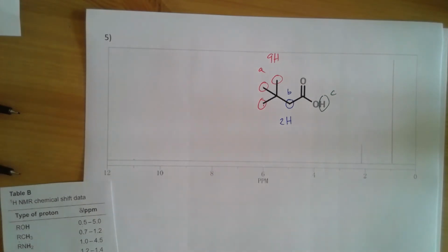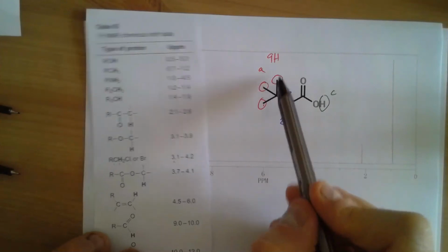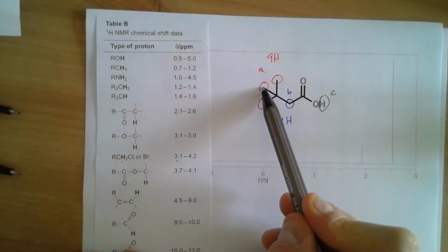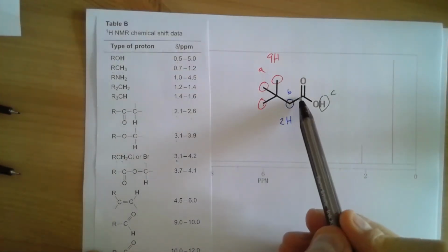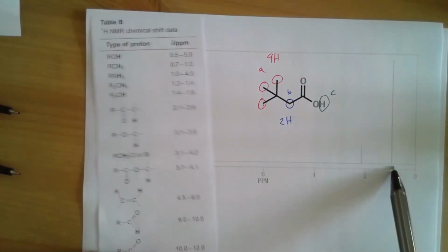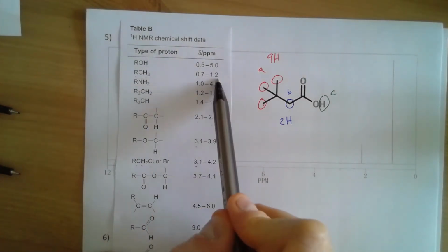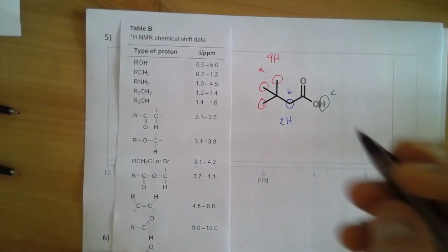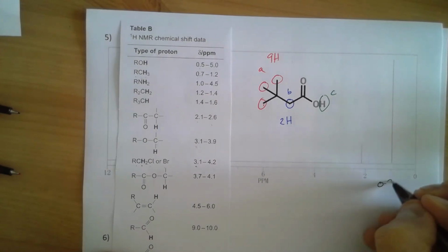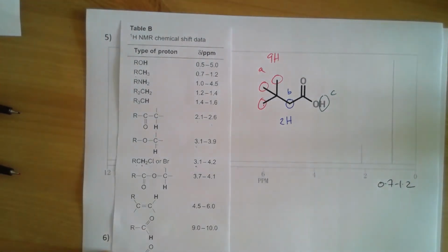This one's a nice straightforward one for us to sort out using chemical shift. 9H environment, these CH3 groups are a long way away from any electron withdrawing groups, so they're going to be quite shielded, so they're going to be quite shifted up here. That's likely to be our CH3 groups, which is 0.7 to 1.2, which is just about within the range that we'd expect.